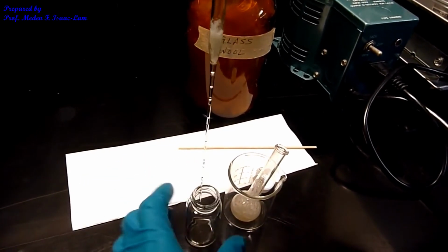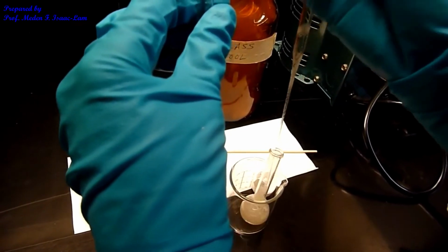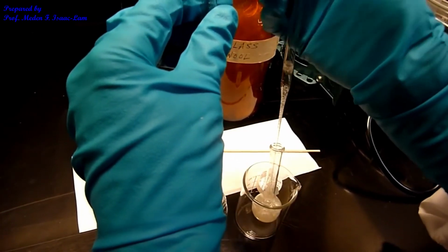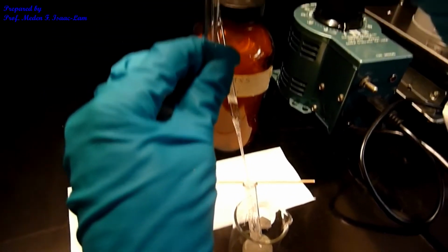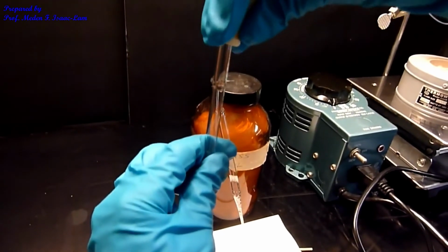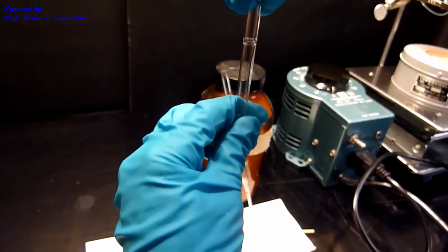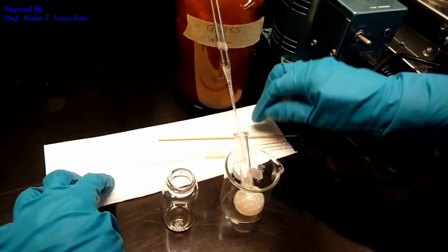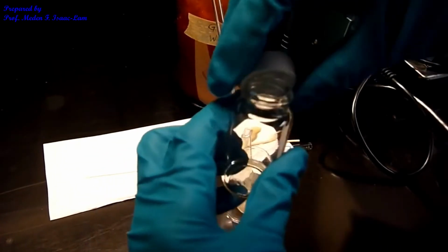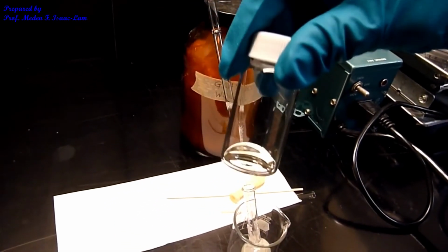So I should have enough for the NMR. So I push it in so I can have enough sample. So that is our NMR sample here.